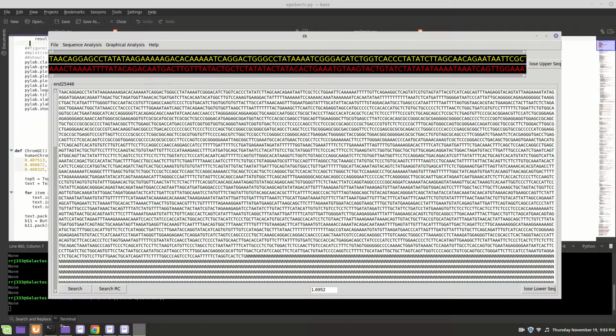Alright, here we are again with our sequence. It's the last gene in our contig, and I'm going to show you how to find your transcription start site, given that we already know that our genes are near a CpG island. So we're going to start.